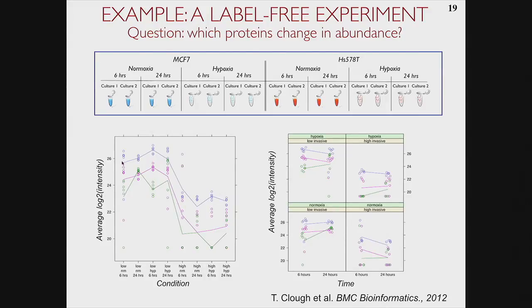So, well, what do we see? We see that the peptides generally have a fairly similar story as far as comparing this group to this group. However, within these parts, there's some disagreement. So this, for example, is a low intensity. Maybe it's a missed peak or misquantified peak somehow. Here it looks like there's some interference, right?